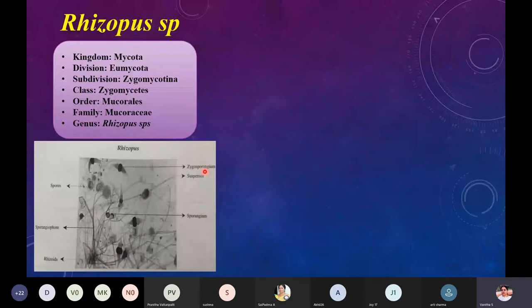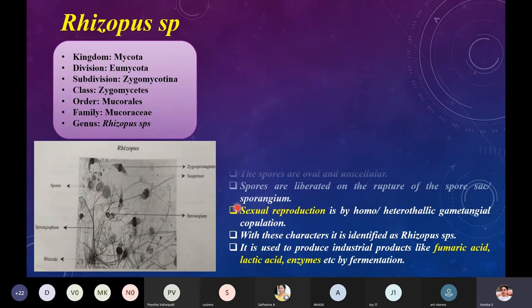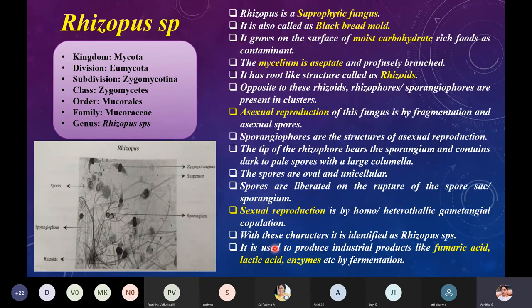In the picture of Rhizopus, you can see a mass structure called rhizoids from which branches arise called sporangiophores. At the top you can see a bulb-like structure called the sporangium. On top of the sporangium you will see spores being released, and the larger structure is called the zygosporangium. There are certain important features that differentiate Rhizopus from other fungal species.